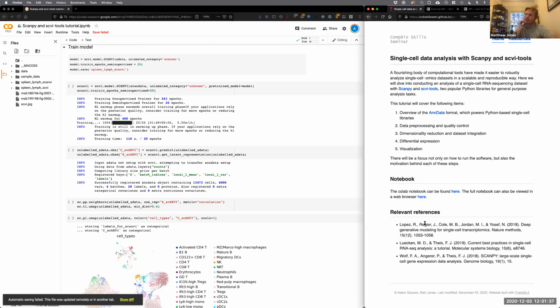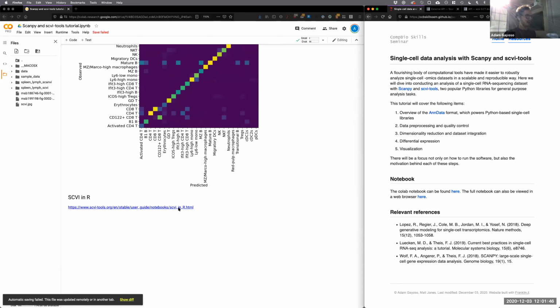Yes. And then someone has another question about how to load a large Seurat object into Python. Right. So for that, we have a tutorial, scvi in R, and there are a couple of ways. There's this package called zellkonverter, which is a Bioconductor package. That's one way to do it. You could save it as a loom object from Seurat. That's the second way. You could also use reticulate. What you would do is use the reticulate R package and build the AnnData object from R using the reticulate interface. It's worked in the past for me. It sounds like if your object is 70 gigabytes, I'm not sure how well that would work. It seems like a loom or zellkonverter might work for you. Zellkonverter is from the Theis lab, and it's a Bioconductor package.